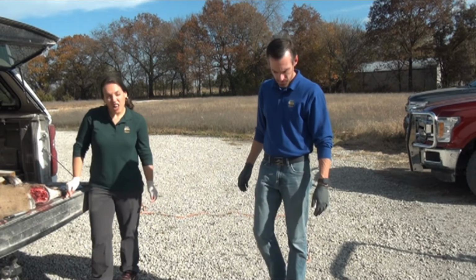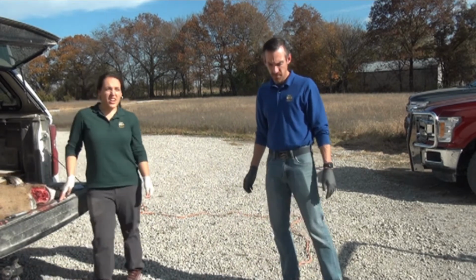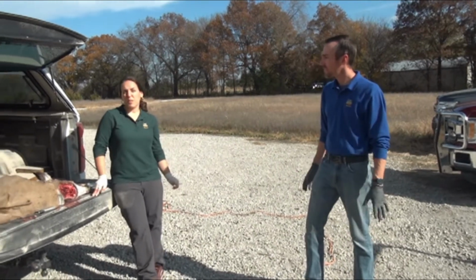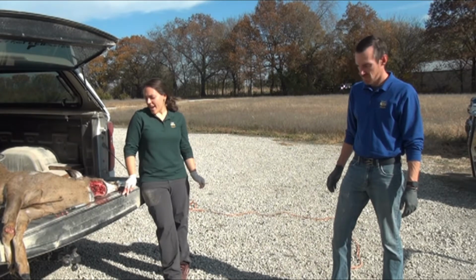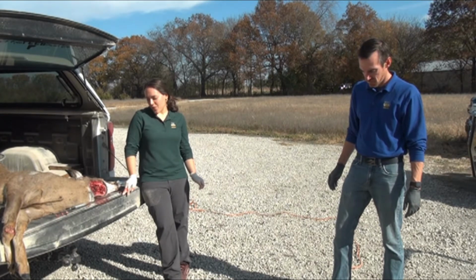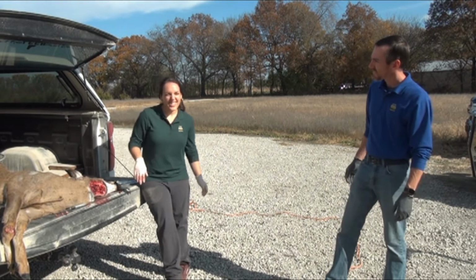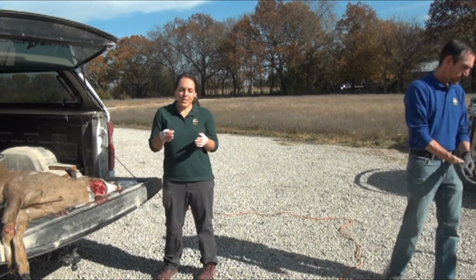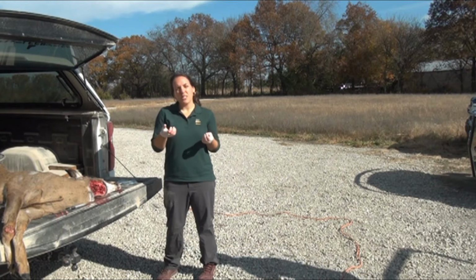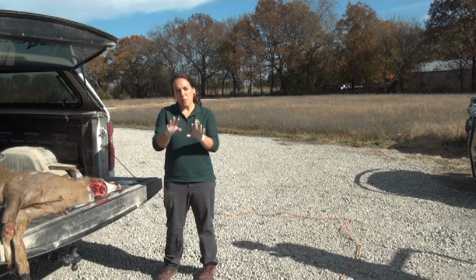Yeah, I would also say color. Color can really vary. Sometimes they'll be a deep purple, sometimes they'll be pretty white like that, or a light tan like that one. And hopefully in our next head that we're going to sample from, we'll see there's almost a translucent appearance to it. It almost looks like a water ball in there, amongst the tissue.